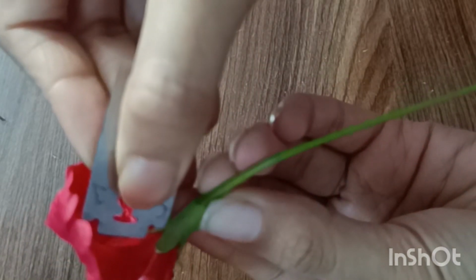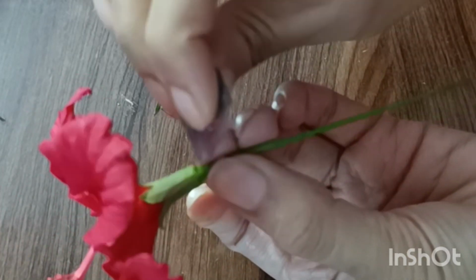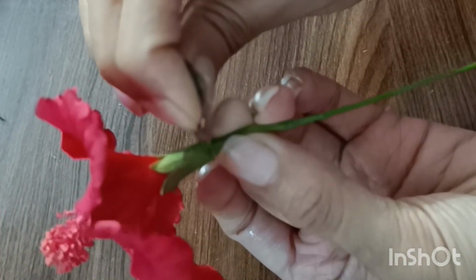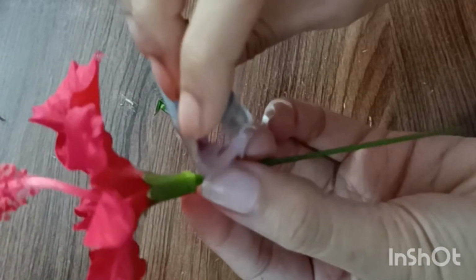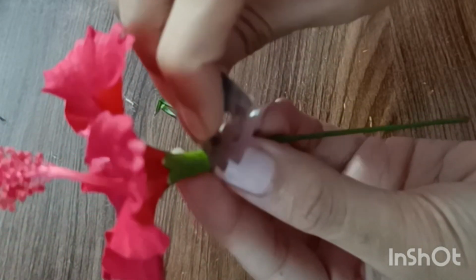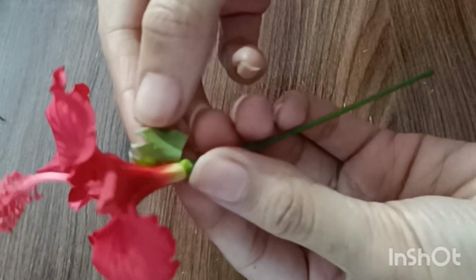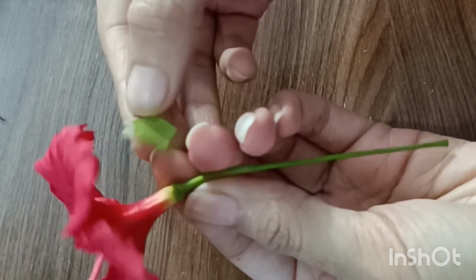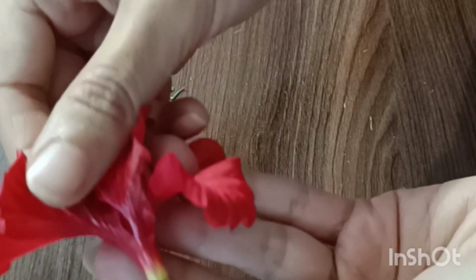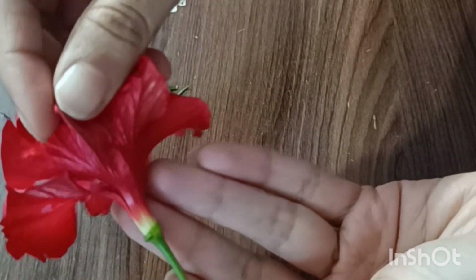Now, I remove the sepals and observe the corolla. It consists of 5 large, brightly colored petals. Petals are polypetalous, free. They show twisted estivation. Function: attract pollinators.